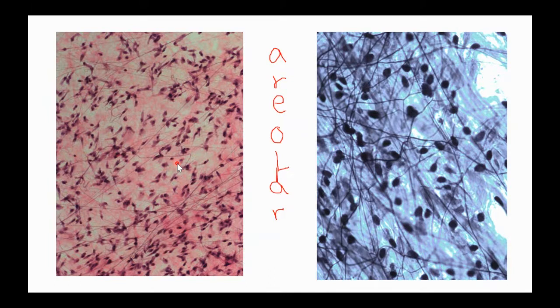There are also, I know it's probably hard to see on your screen, some really light proteins here in the background that branch a little bit. These really light proteins are the ones we talked about previously called reticular proteins. So I've got some reticular branching proteins inside this tissue, these curly elastic proteins, and then you're going to see some of the darker collagen proteins. That's the big thick lines that we see all over the place. Areolar connective tissue has all kinds of different proteins inside of it: elastic proteins, reticular proteins, collagen proteins, they're all there.